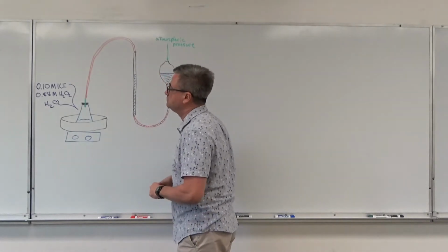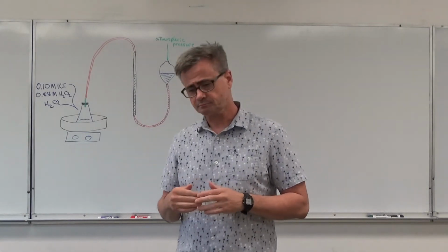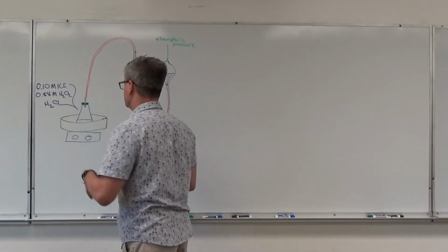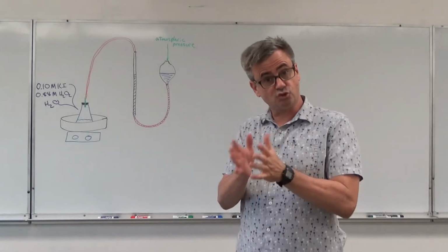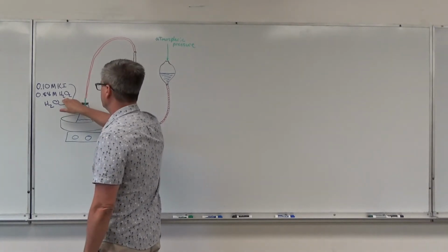In part, that's just convenient because we can describe it as a molarity. But we can't look in there. It's not visible. We can't use UV light. And there's no way to monitor directly how the concentration of hydrogen peroxide is dropping.